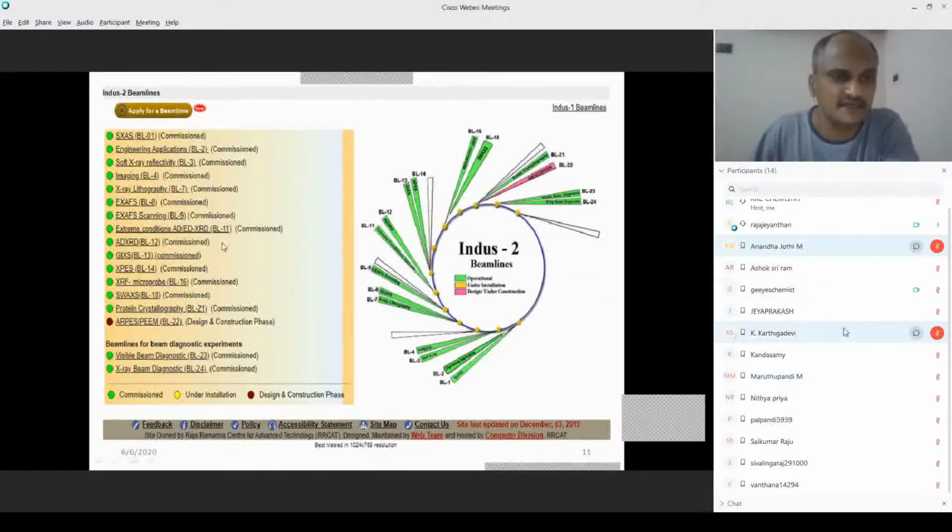Okay. Then, we are going to see only these 2 techniques, soft X-ray absorption, that is NEXAFS, and the other one called EXAFS. I will explain the others in a very short time. Beam line 11 is called angle dispersive X-ray diffraction. We have another option also, energy dispersive X-ray diffraction, in beam line 11.